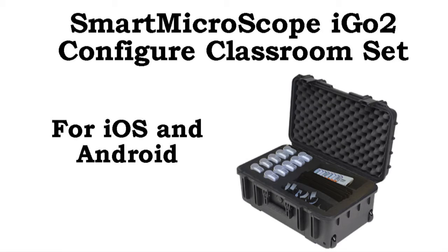SmartMicroScope iGo2 Configure Classroom Set for iOS and Android devices. If you have more than one iGo2 in your classroom, you're going to want to configure it so you know which iGo your device is connected to. We're going to walk through this process one step at a time.